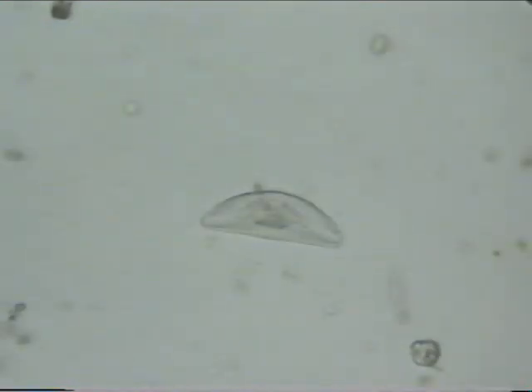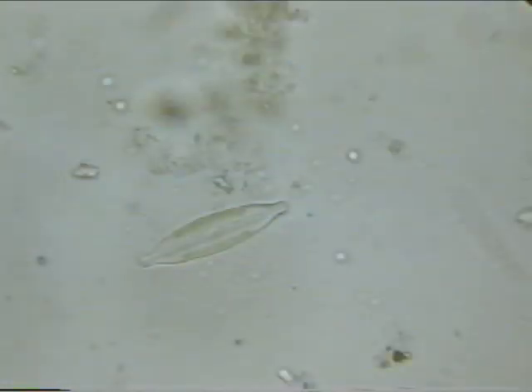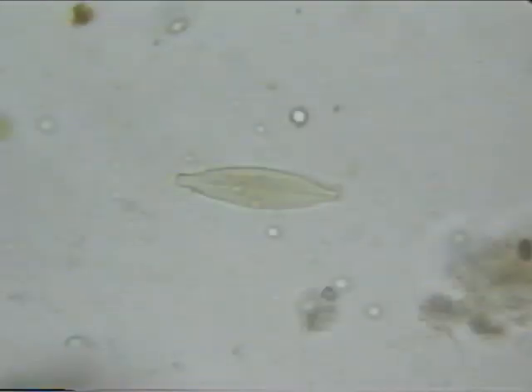Here we're looking at a diatom. A diatom's a microscopic creature that has a hard shell, much like a seashell. When these little fellows die, they leave their shells behind. Many, many shells altogether are called diatomaceous earth. We use diatomaceous earth to filter swimming pools.